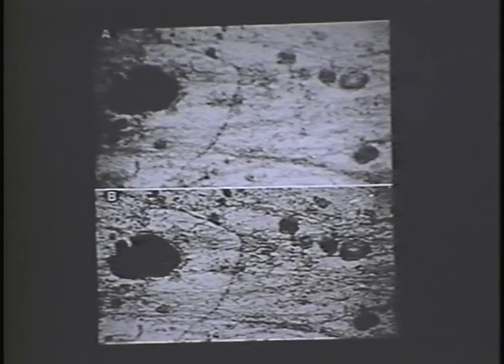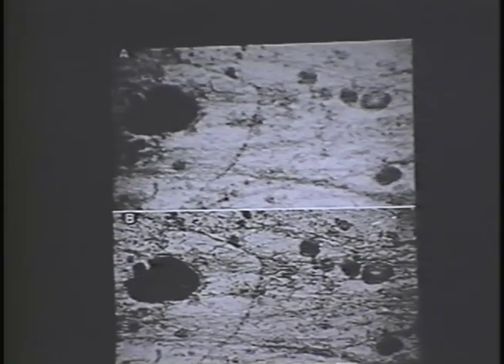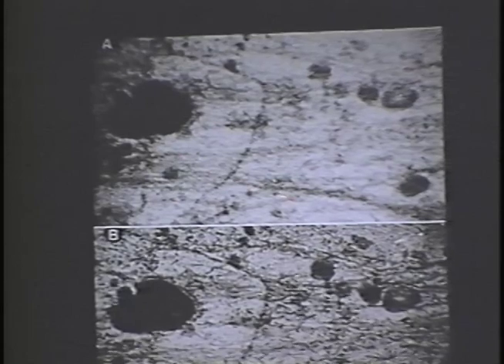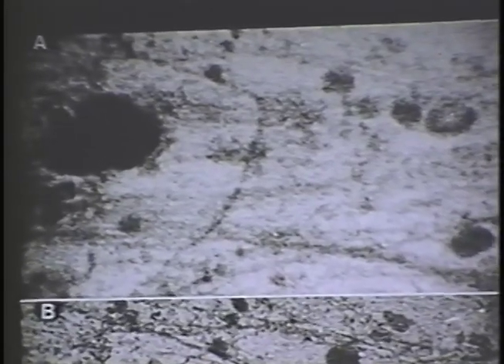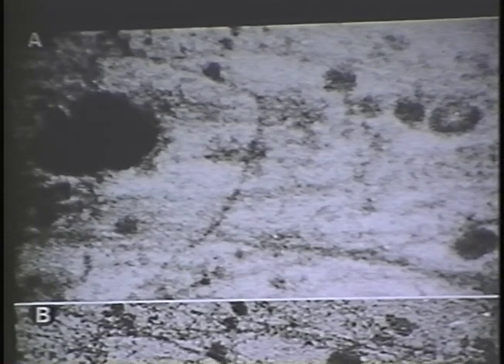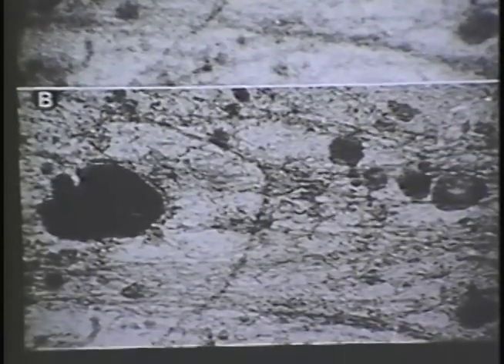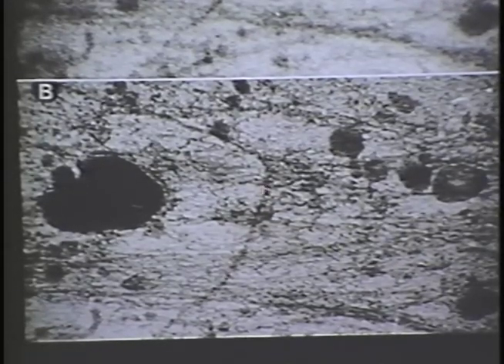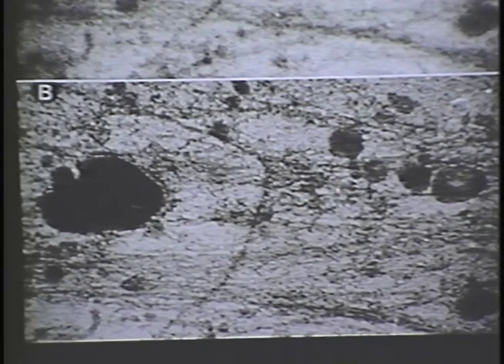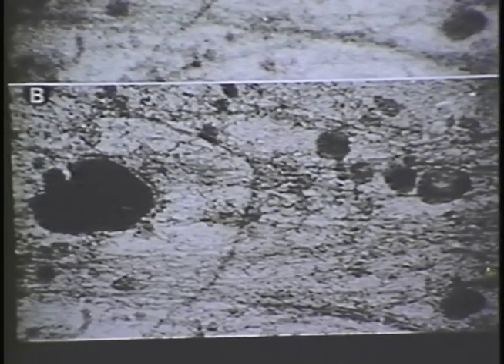This slide illustrates the importance of phase contrast focusing using frozen hydrated samples. Panel A shows a thin portion of an elongating PTK cell with the image taken at focus, and panel B shows the same area taken at 20 microns under focus to obtain phase contrast. And at phase contrast, one can see the details of the organelles and resolve individual microfilaments. Next slide.